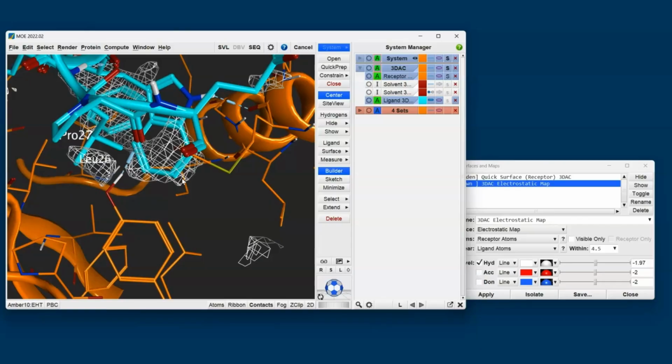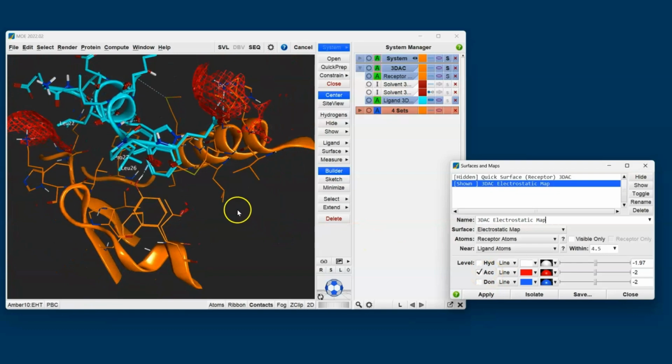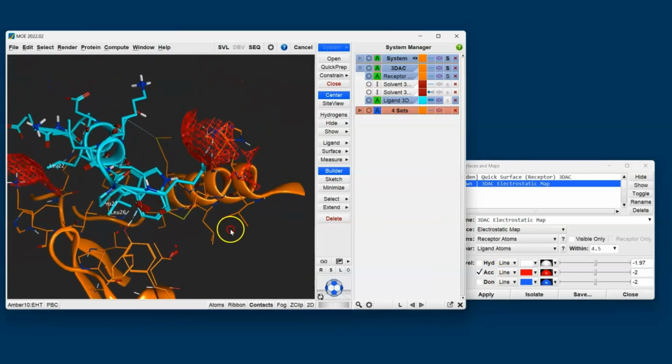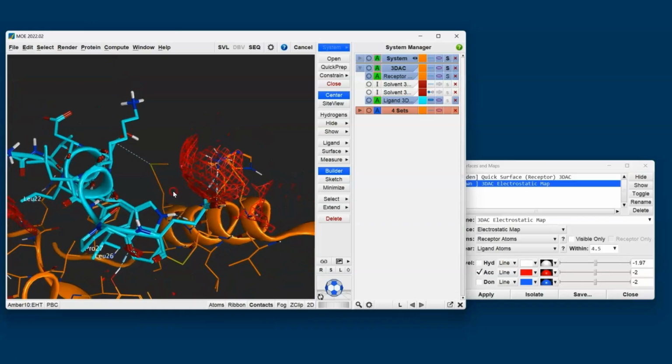It's touching the hotspot, it's got the right type of interaction, which tells us there's nothing we can do here to optimize the design of the peptide. So with that, I'm going to toggle off hydrophobic hotspots and move on to look at the acceptor hotspots. So here I can see that we've got two main acceptor hotspots. One of these we already identified acting on the terminus. We can see there's already good hydrogen bonds, so this acceptor has been utilized.